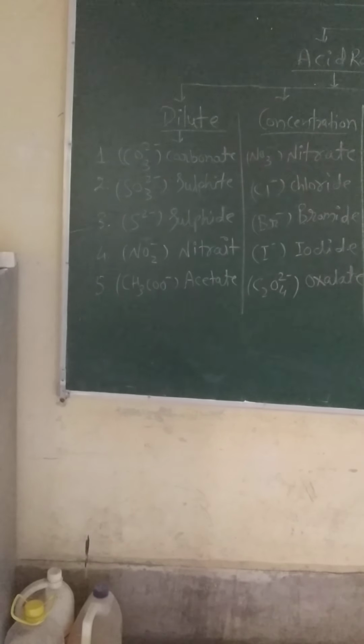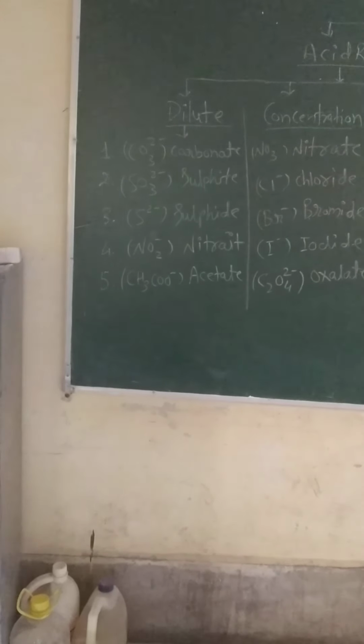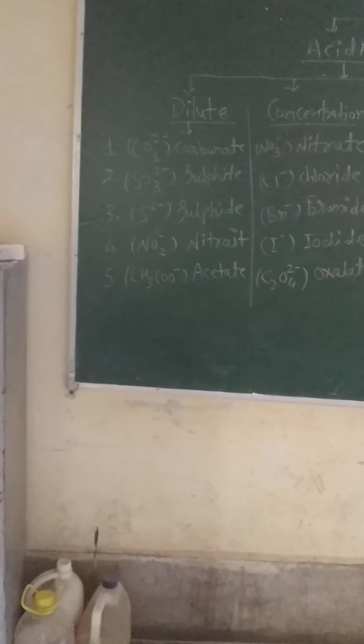Then the third confirmatory test is a longer process. First, make the soda extract solution. How do you make soda extract solution?